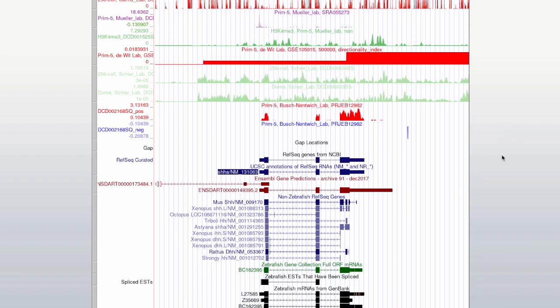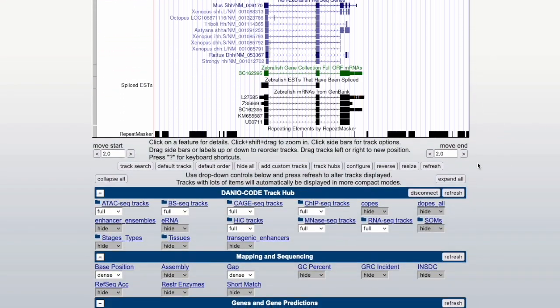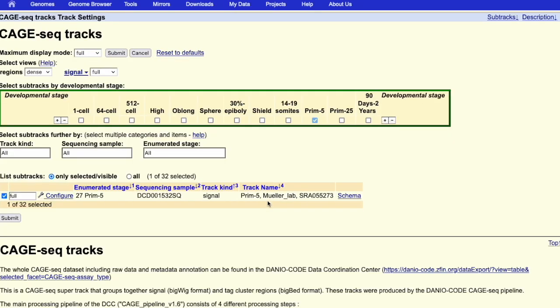We could use the RNA-seq tracks to answer our question, but CAGE-seq should give us a bit clearer image of the expression. So let's go to the CAGE-seq tracks page and select all stages.